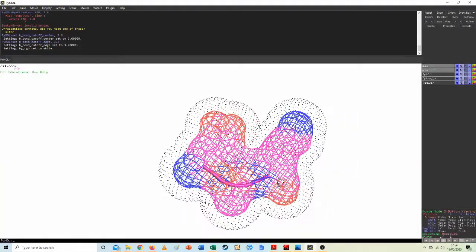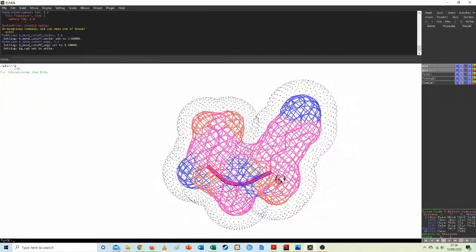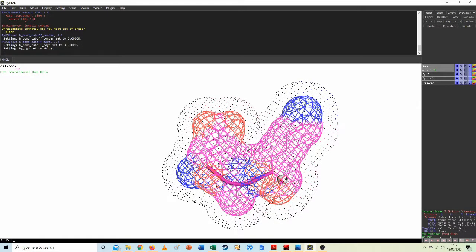Right, okay, what we're going to do next is take a look at a fully formed protein, and we are going to talk a little bit about how all the interactions, all the types of bonding help form those alpha helixes and those beta pleated sheets.